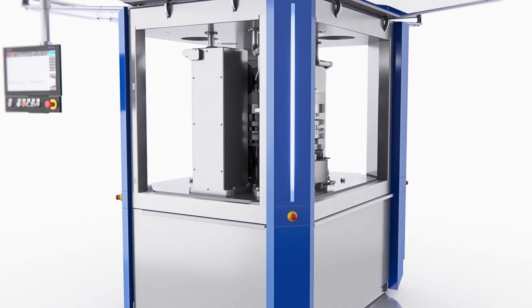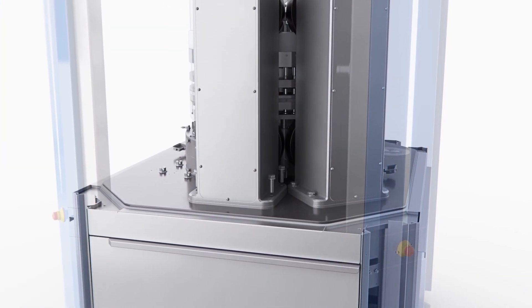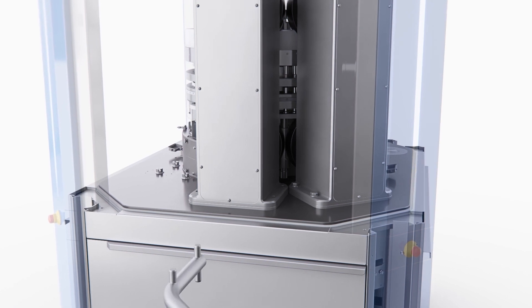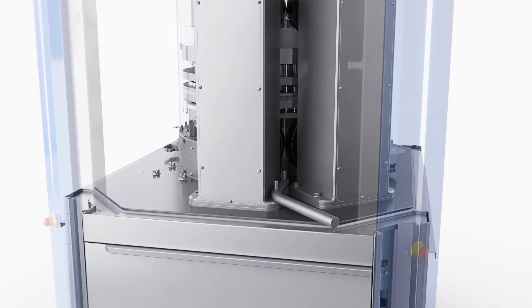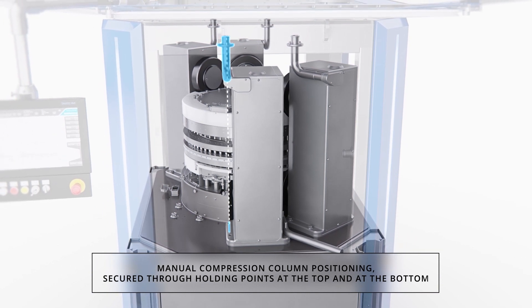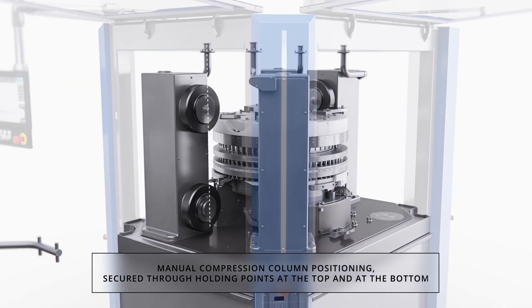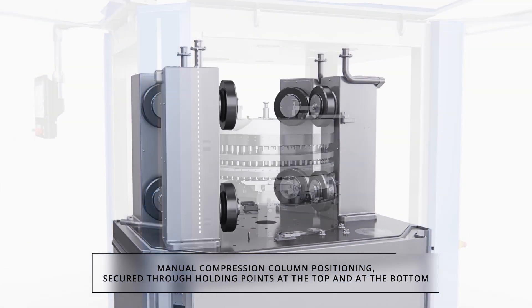The compression columns can be easily repositioned to permit turret exchange or machine cleaning. They are rotated manually around a holding pin located under the column and additionally held to the headpiece by the electrical supply cable at the top of the column. The result is a fully safe procedure.